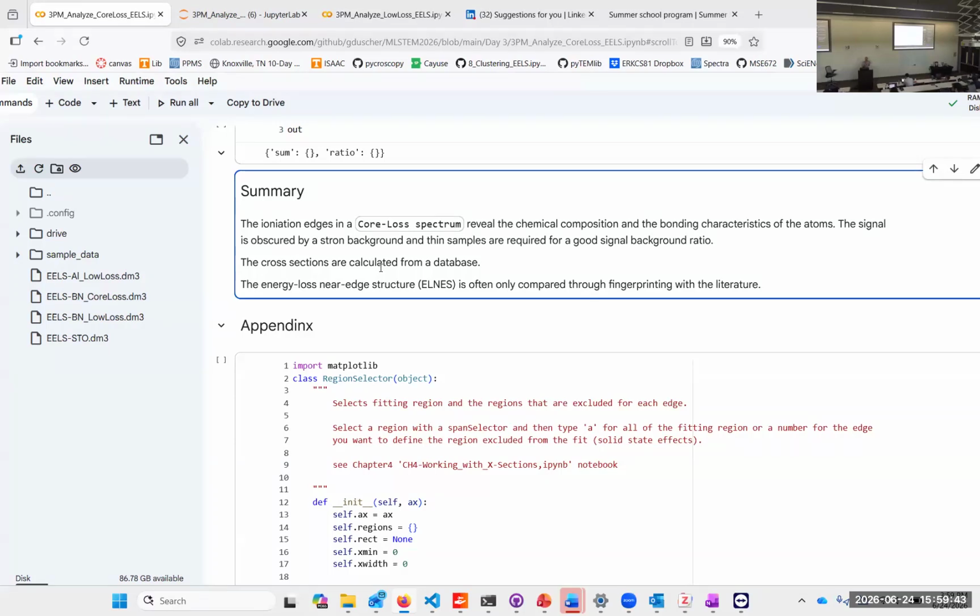And so the T over lambda is very close to the T over lambda, so the relative thickness, that you normally get. But then you also get additional information about the absolute thickness that you can directly use from that. That's an estimation. So the T over lambda is, if that is any different than what you normally would calculate, it's different.